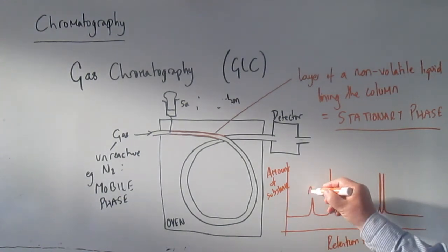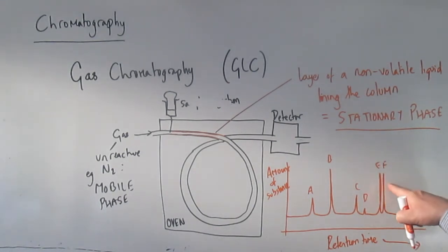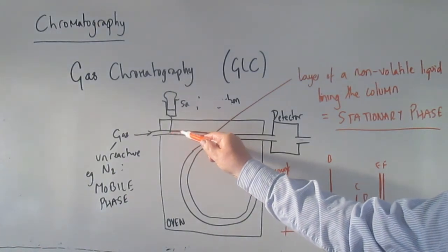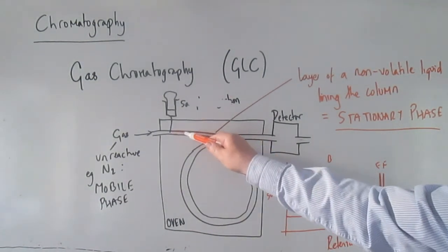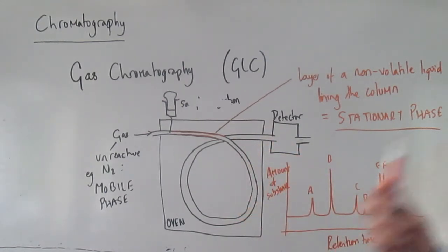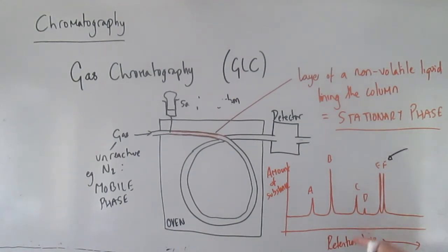So let's think about what it means. If we label these substances A, B, C, D, E, F, and we think about why does F have a much longer retention time than A, what does that mean? Well, remember the process is that all the substances enter at the same time and they start flying through the column in the gas phase. The fact that F takes longer to come out means that its journey through the tube has been interrupted more of the time. And what interrupts it is dissolving in the stationary phase, because as soon as it dissolves, it stops moving. So what we can conclude then is that F has the longest retention time out of these substances because it is the most soluble in the liquid stationary phase.